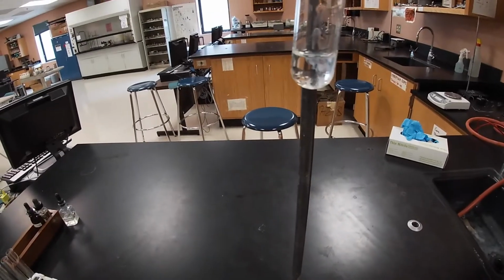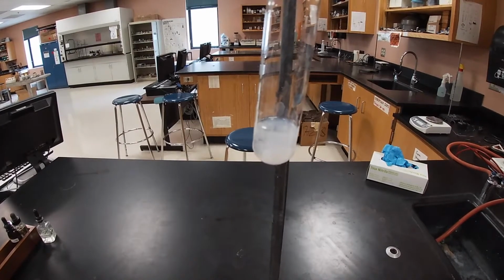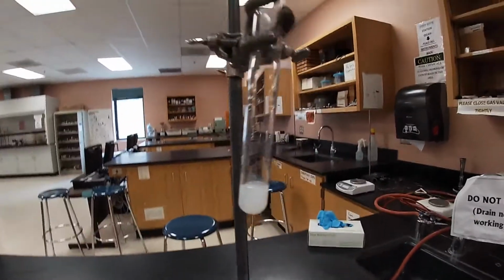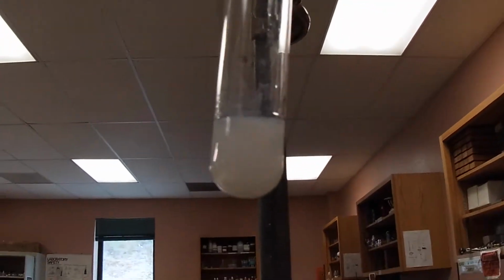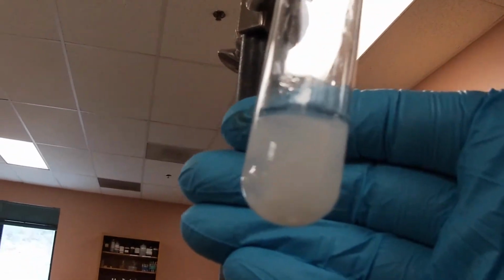Whoa! All of a sudden we get some excitement. So now I'm going to add it all. I'm going to return my dropper, and we're going to take a look at it from the bottom. The reason I go to the bottom is so that you can see that there is some settling of a solid at the base. We do get a cloudiness, and hopefully by putting my glove behind it, you can definitely see that cloudiness and the effect of substance coming out of solution, while there's some other stuff still in solution.